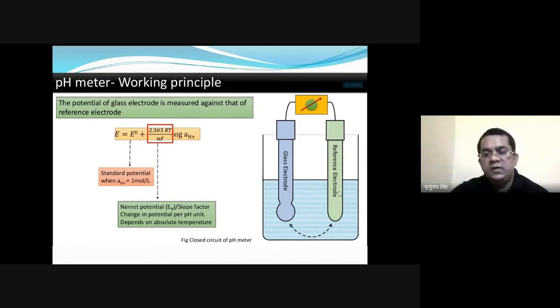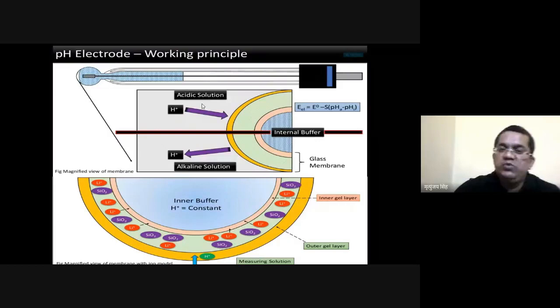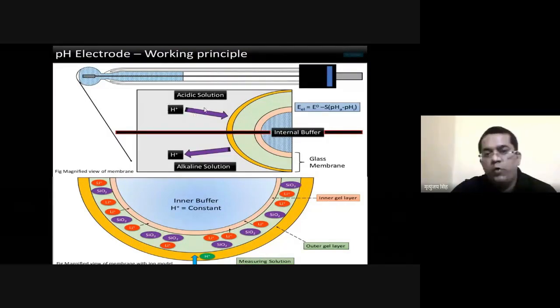The pH meter generally contains 2 electrodes. Sometimes it's combined and only 1 electrode is there. Here, 2 electrodes: reference electrode and glass electrode. If you are measuring acidic solutions, hydrogen ions are going to interact with the pH glass electrode bubble. This is the measuring sensing element.